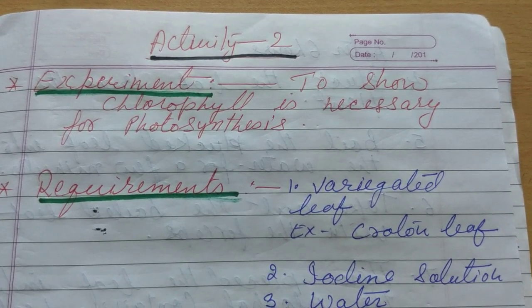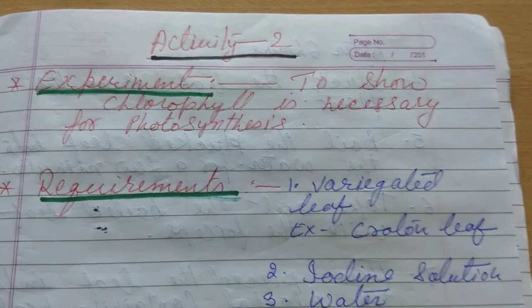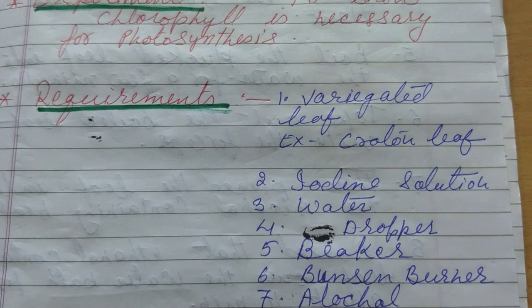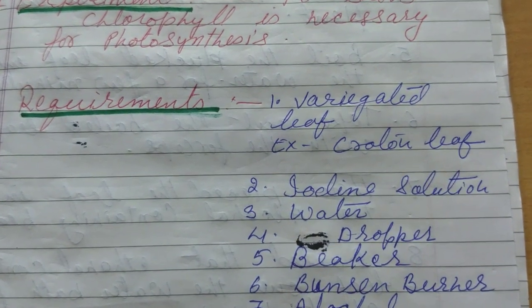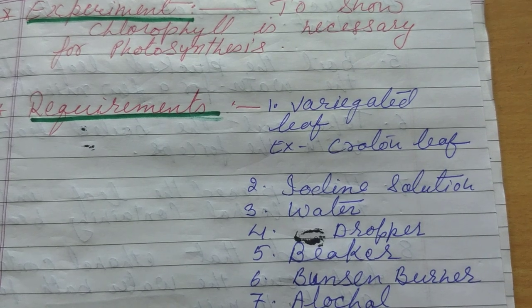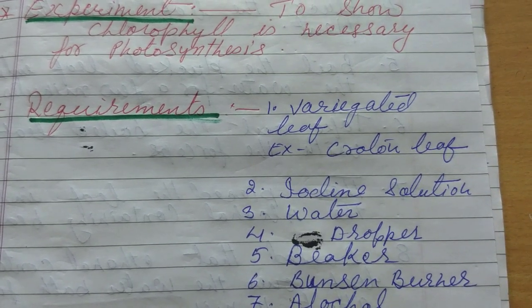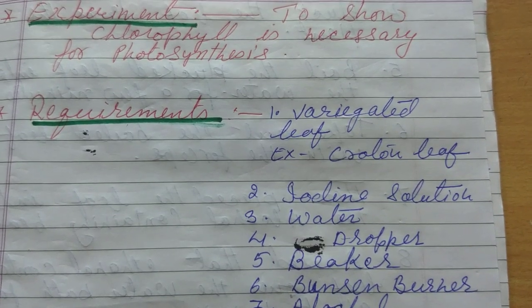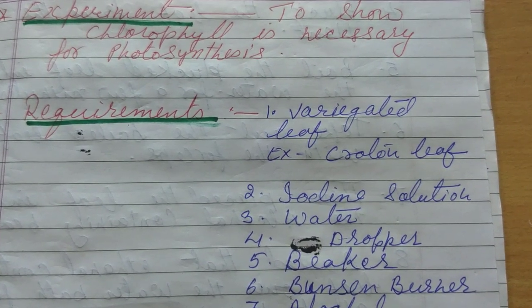So let's move to the requirements. What are the requirements for this activity? The first requirement is a variegated leaf. What do you mean by a variegated leaf? It is a leaf which has different colors — a very simple example is the croton leaf. So here we have to take a variegated leaf.